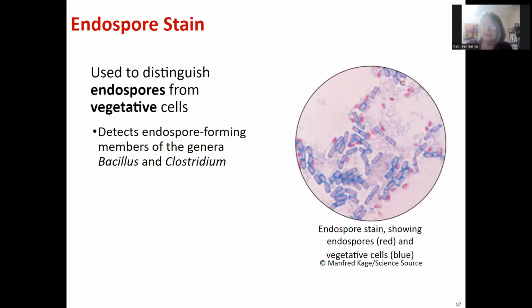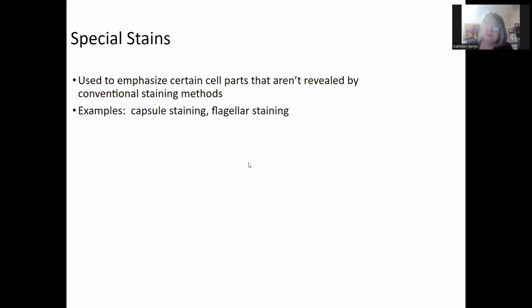negative side for that. So in the spore stain, you're looking at the ability, or you're looking for cells that have been able to produce bacterial endospores, particularly Bacillus and Clostridium organisms, and you're able to distinguish those from their vegetative or growing cells, which are the ones that are still growing and dividing, whereas the spores they've produced kind of like to save themselves.